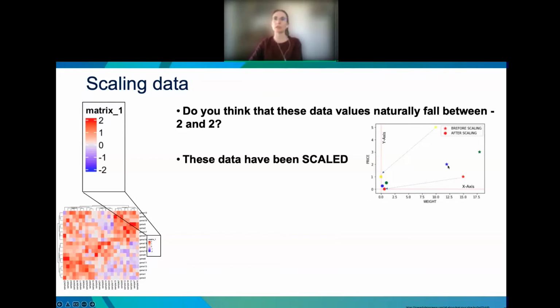So before scaling, we have these 4 points that look like stars. Before scaling, the points are far away from each other and have larger values. After scaling, the points still have the same relative relationship to each other, but they're all in the same ballpark. They're between 0 and 1, let's say. Scaling in this instance is compression. Compression is one way to think of it.